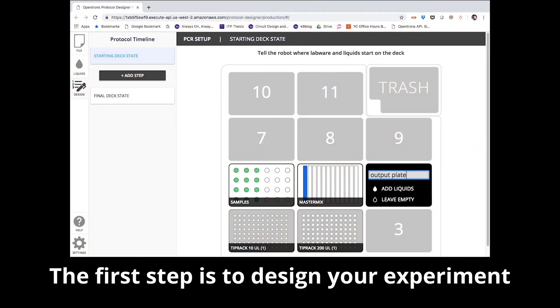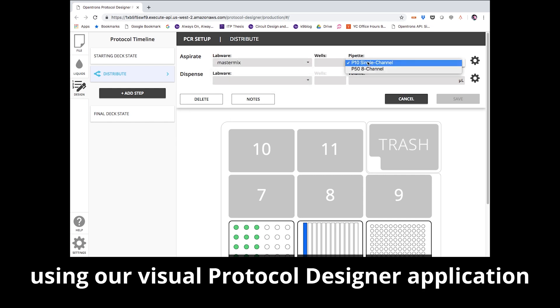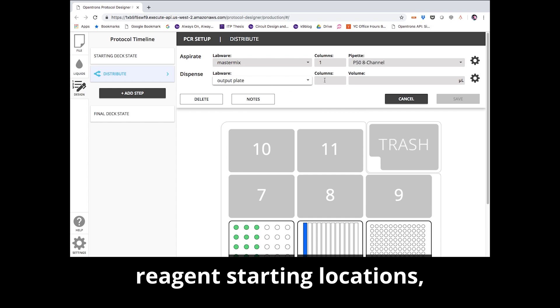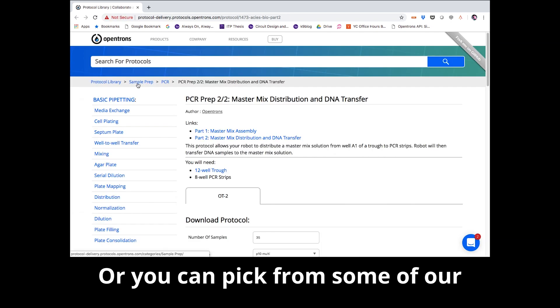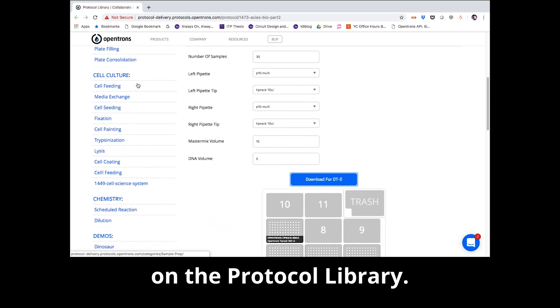The first step is to design your experiment using one of our online tools. You can start from scratch using our Visual Protocol Designer application to choose your labware, reagent starting locations, and define each step of your protocol. Or you can pick from some of our pre-made PCR prep templates on the protocol library.